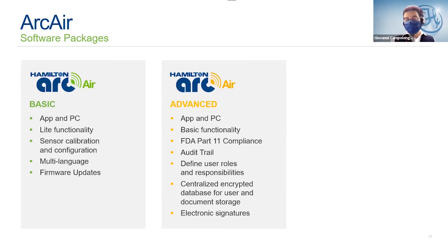Now, if you recall what Kelsey showed you in the beginning, we say that in order to have proper control of CO2 and to benefit from all the advantages of controlling CO2, it is important that you monitor it at the R&D scale, at pilot scale, and at production scale. You cannot have a production scale without a sensor that is ready to be used and compliant with GMP, like Part 11, especially in biopharma applications.